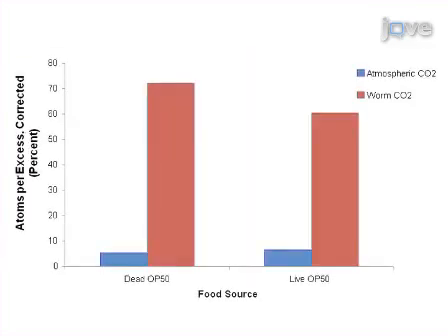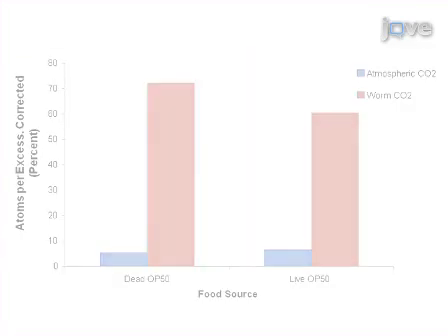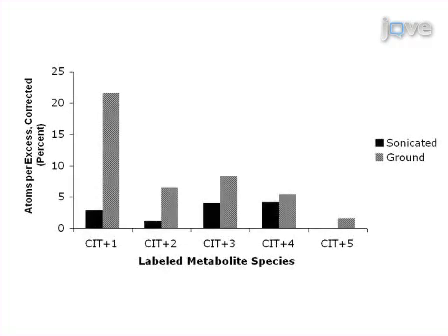Results are obtained that show effects of variable durations of isotope exposure, bacterial clearing, and alternative worm disruption in wild-type worms to interrogate isotopic abundance in intermediary metabolites. This method can provide insight into C. elegans intermediary metabolism. It can also be applied to other systems, such as mammalian cell lines and tissues.